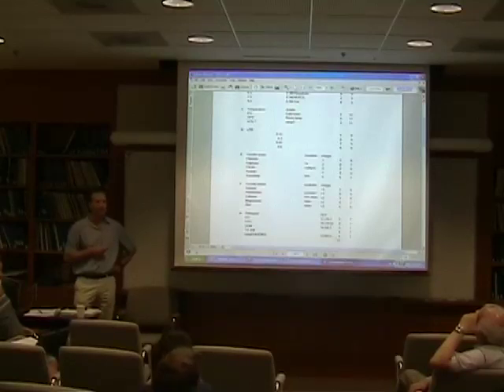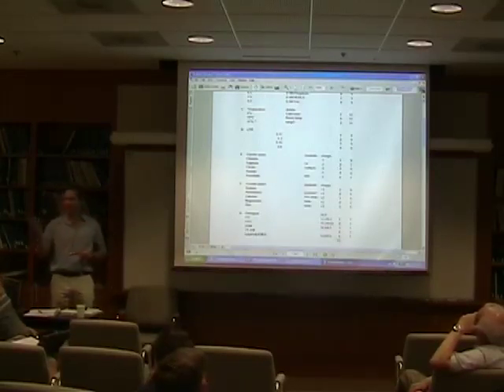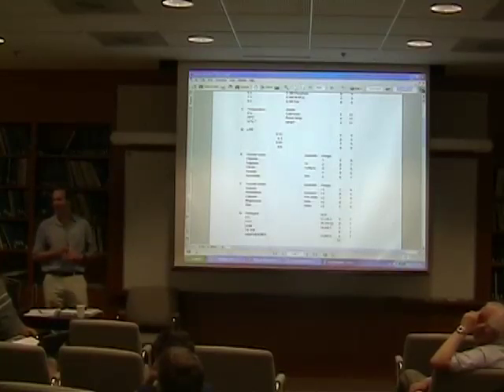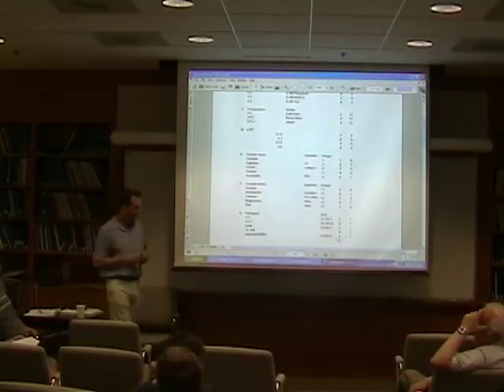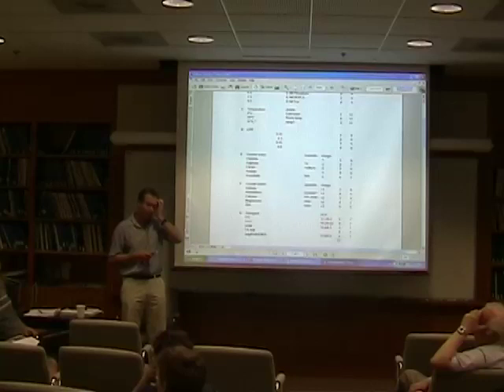How long can the glucose be kept? How long can a tube... I think that depends on the protein. But how long can a 2D crystal be kept? Years. I'll go far into years. It really depends on the protein, and if you have a very subtle one, you almost kind of go two weeks.